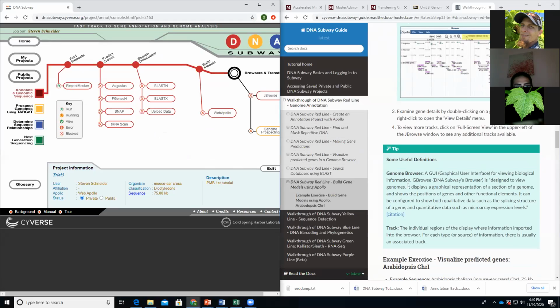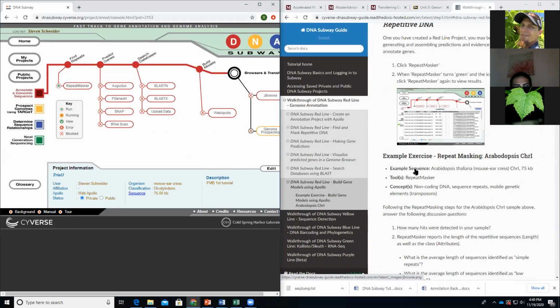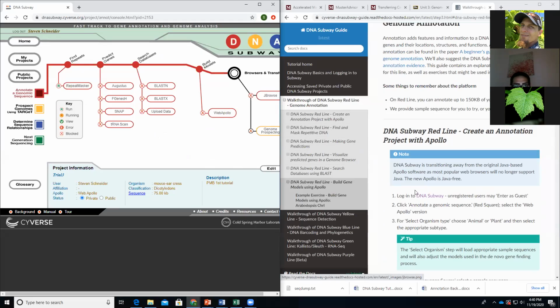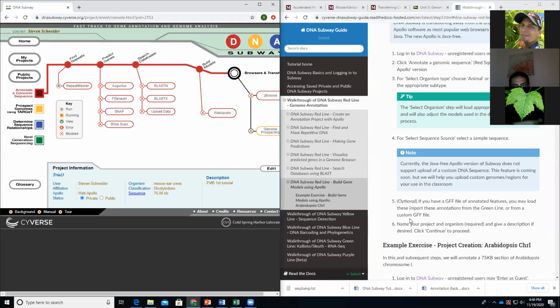Okay. So all the instructions are right here. It may be tedious because we've never used it, but it's good to have tedium because it's going to be literally step by step. Now, previously, I required that you answer these questions on paper, having a third doc open. I am not going to. Congratulations, you're welcome. But you ought to answer them at least on scratch paper or in your head.